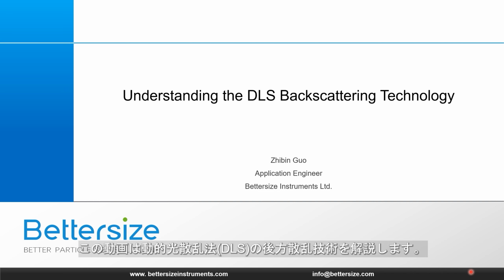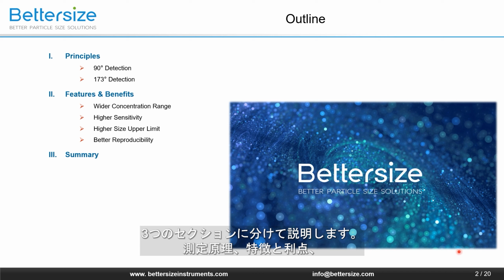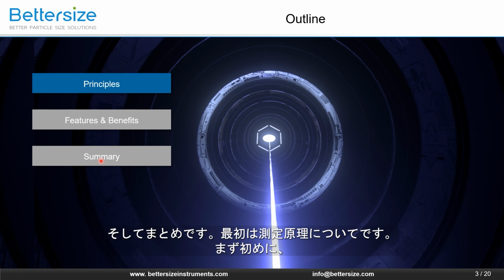This presentation is about understanding the DLS backscattering technology. I'm going to give a brief introduction to it. This talk includes 3 sections: principles, features and benefits, and summary. The first section is principles.